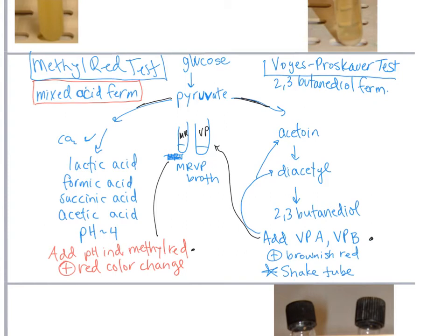Okay, but remember, we have 2 organisms, and that's actually Pseudomonas and Alcaligenes, that are not in that family, Enterobacteriaceae. They're not in that family because they don't ferment glucose at all. So they're not going to do either pathway. All right, so positive for one or the other, or neither. But you won't get positive for both.